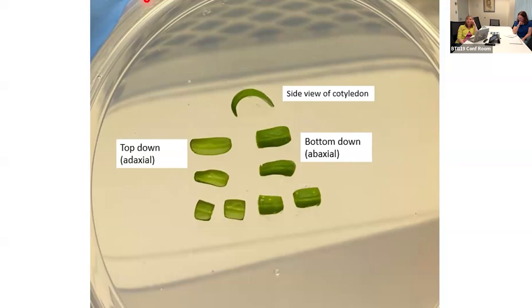So those are the conditions we use for the seedlings to get the cotyledons. Is the humidity controlled for that room? No. And just in general, I do get asked that a lot, and I don't know of anyone who does tissue culture that actually controls the humidity in the room, or in a chamber, that I'm aware of.